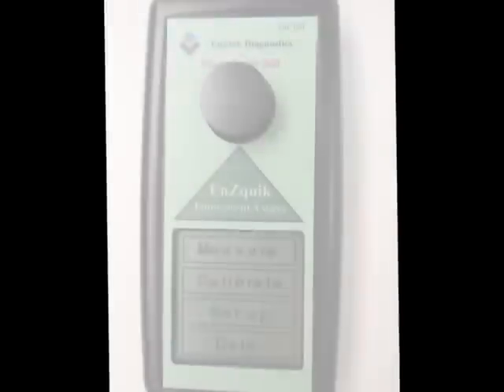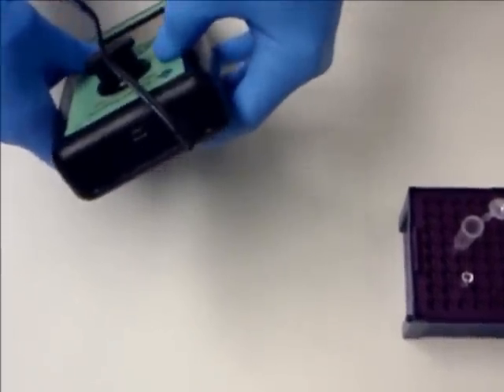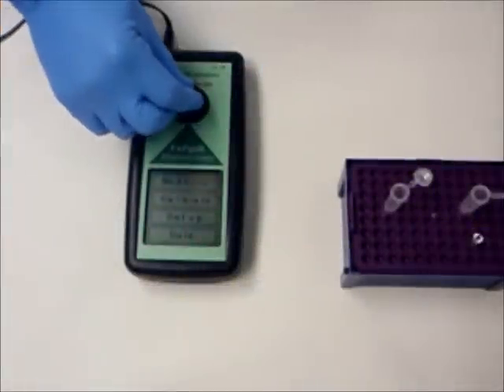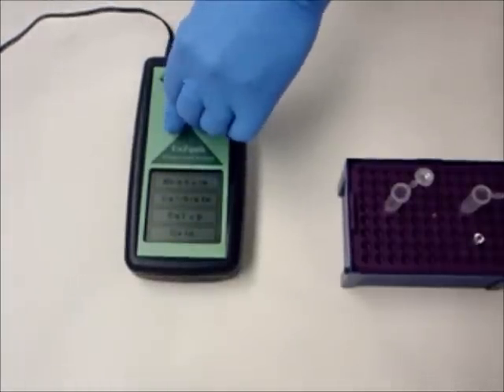For this particular assay, we are using the low wavelength fluorometer. Be sure your fluorometer has been turned on. Place the control small glass testing tube into the fluorometer test chamber and secure the fluorometer cap.